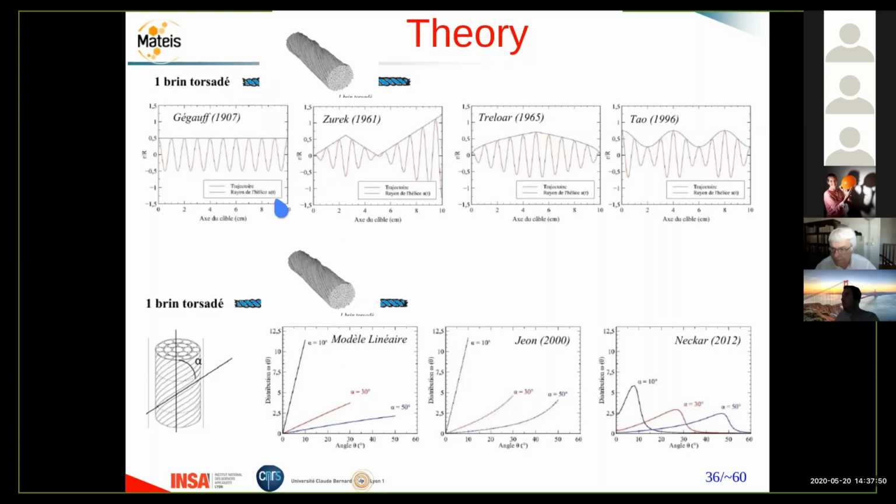you can obtain the angular distribution, which is here you have the angle of all these filaments that you have in the yarn, and this is the amount of fibers that you have oriented at this angle. And this distribution of segments of fibers as a function of the angle is the key information to be able to calculate the behavior.